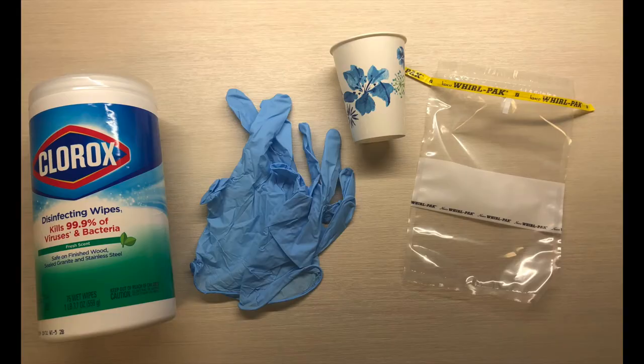Next we will talk about how to feed sample via cut stream. The supplies needed for this methodology are disinfectant wipes, nitrile or latex disposable gloves, an 8 ounce cup, and a whirl pack or plastic storage bag.